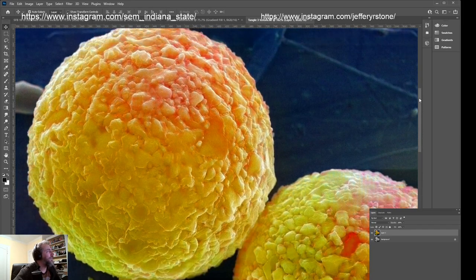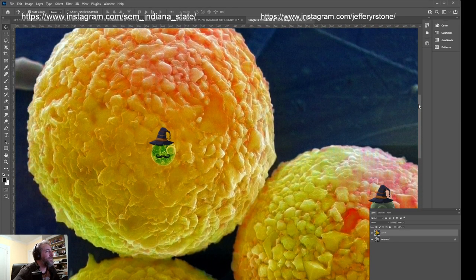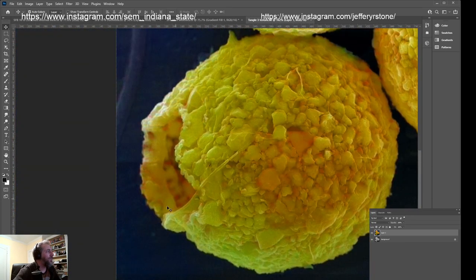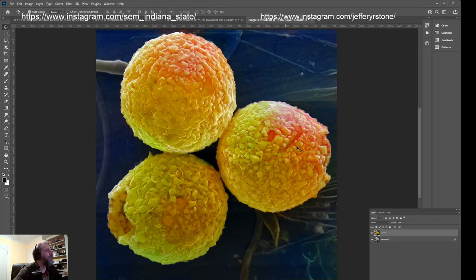You can see this is the test for a testate amoeba. And you can also see that they have a little opening, not visible on the other two, or at least not clearly visible. But there's a little zigzaggy opening right here that the testate amoeba lives in. And this is from a lake filled with demon's blood, where we collected some plankton while Pacific was here. And it also was full of testate amoeba floating in the water.